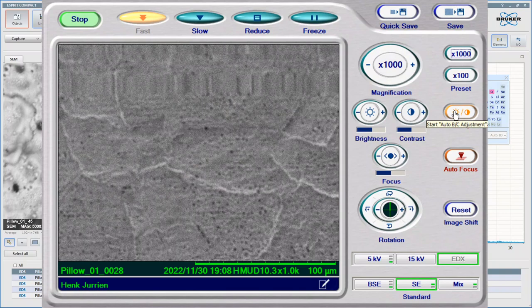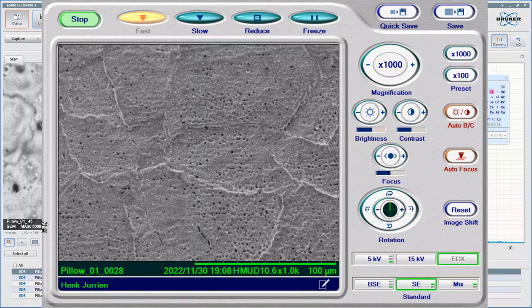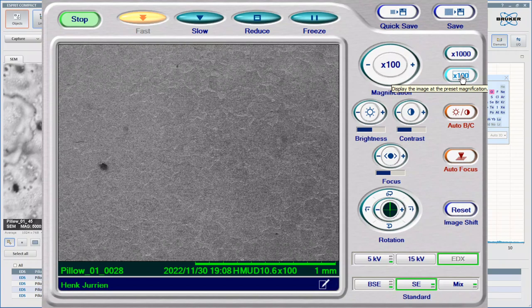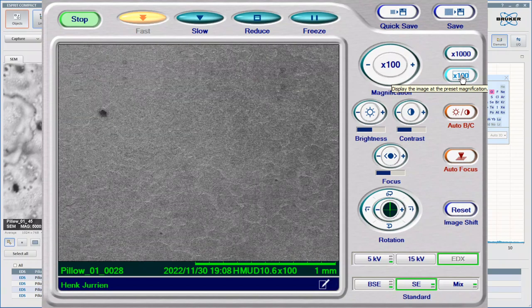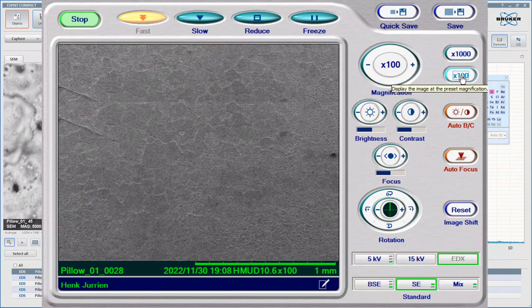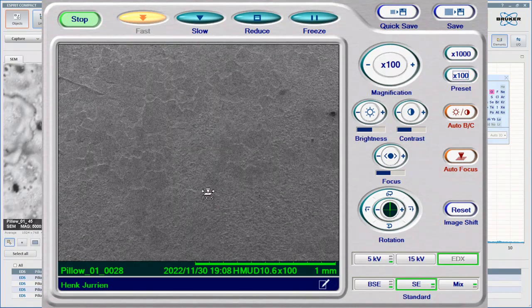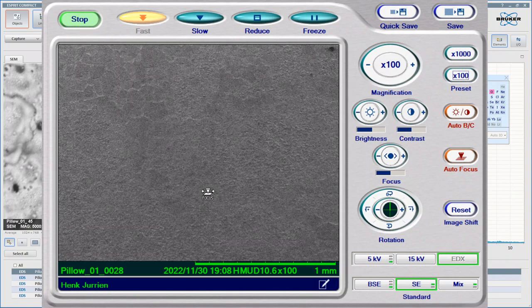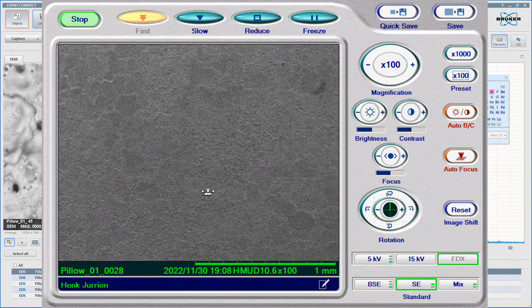So we're going at a different sort of distance here because the surface of the pillow is expanding. So if we come down this area, you'll see it looks a little bit, yeah, there's the cells here, and then this is not quite got this cellular action going on. Okay, and if we look at this kind of area here, you'll see that it is much more disrupted.